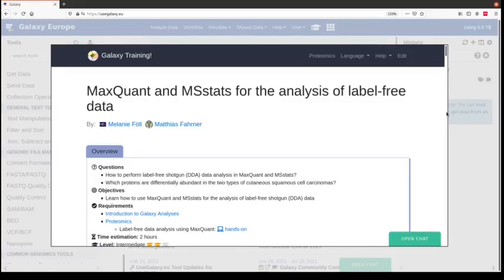Hi everyone and welcome to the proteomics hands-on training. In this training we will learn how to use MaxQuant and MSStats for the analysis of a label-free tissue cohort dataset. The data comes from skin tissue samples of 19 patients with different types of tumors. One group consists of metastasizing cutaneous squamous cell carcinoma and the other of RDEB cutaneous squamous cell carcinoma, which we shorten as CSCC — a type of skin cancer.